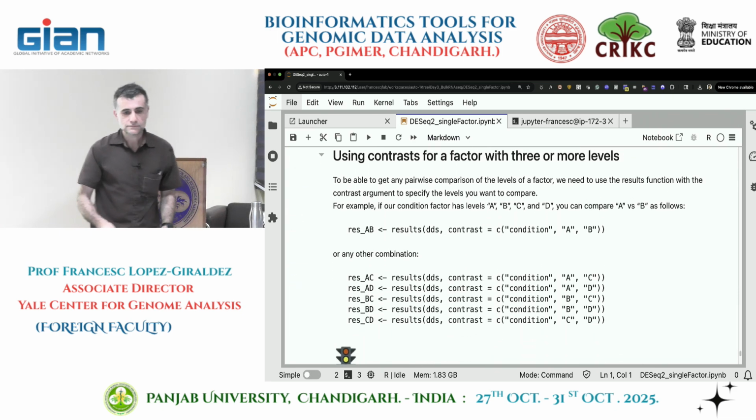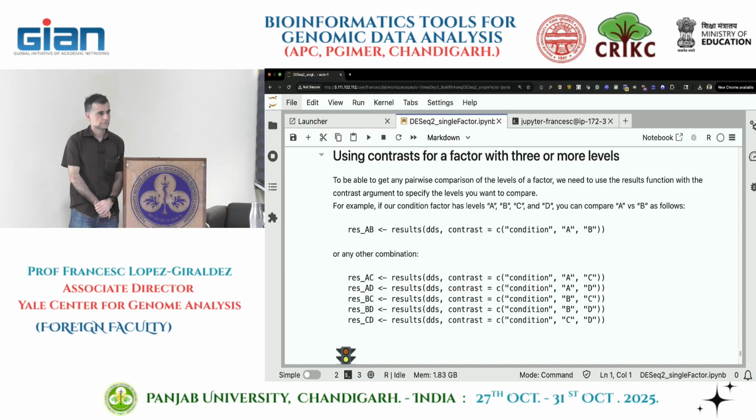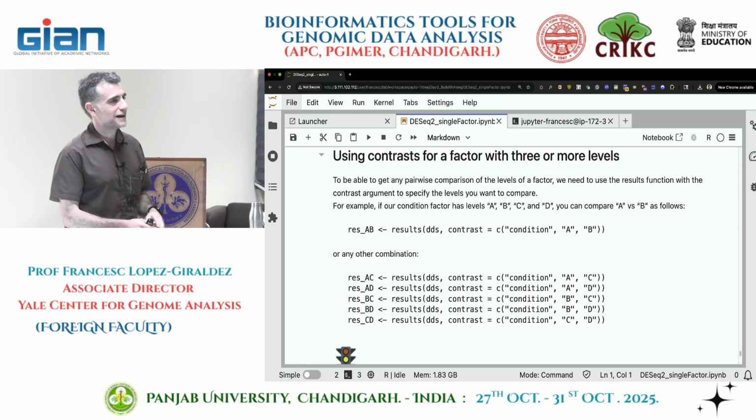So if we use the condition here, taking them by themselves, wild type, sleep deprived, normal here, but we have given just the genotype condition. And that's enough for the analysis we want to do. You don't need to give anything. Is it not analyzing all the groups? Yes, it's analyzing all the groups. So everything you've done so far, it analyzed all.